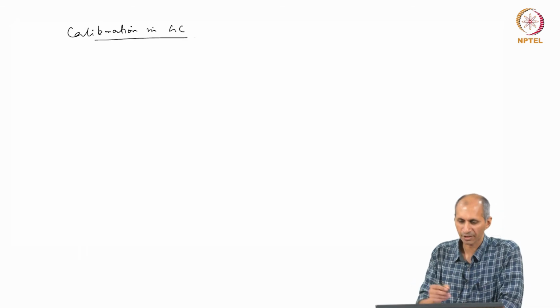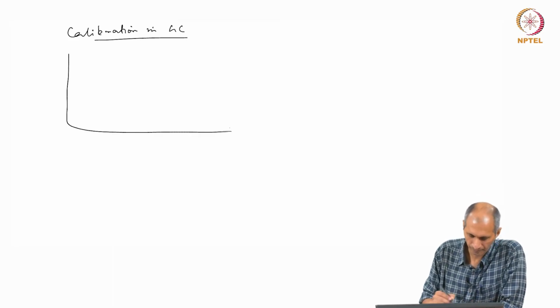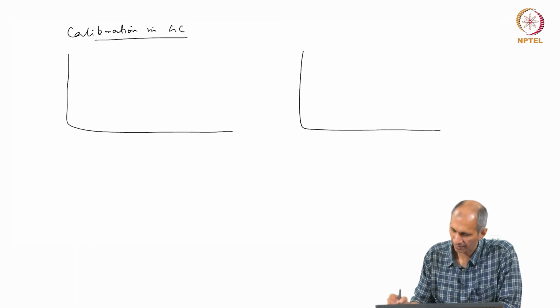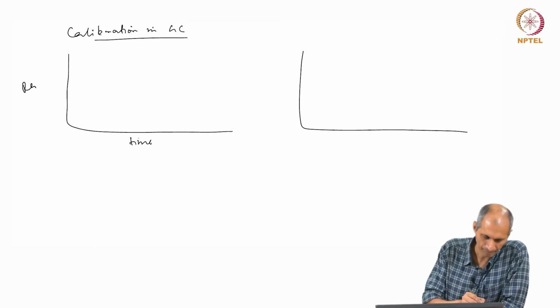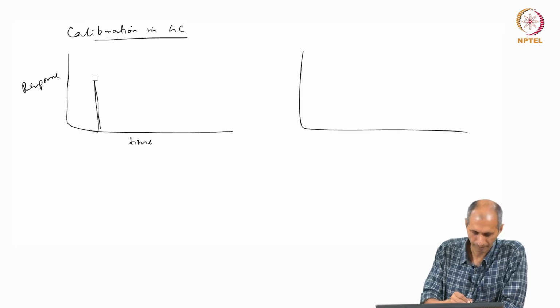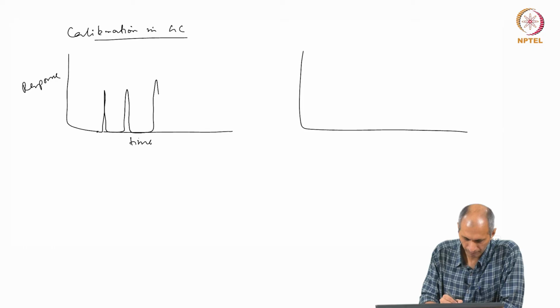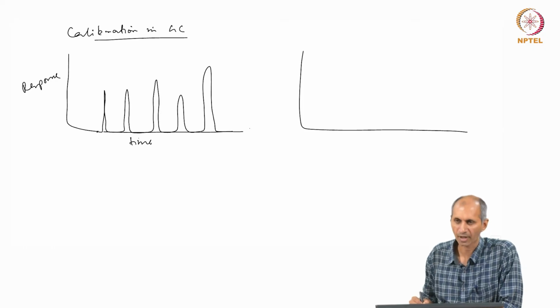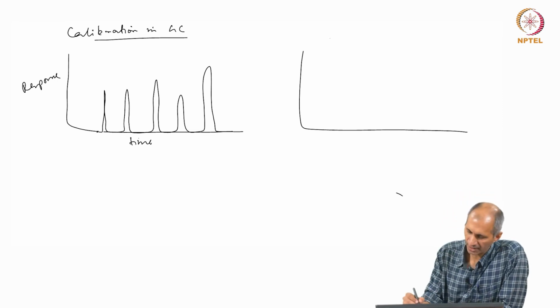In calibration in gas chromatography, I have the chromatogram. Now, let us say I have some peaks like this, and then I need a calibration.